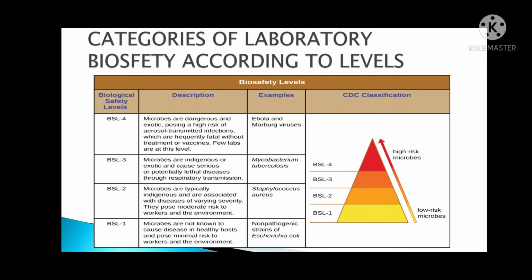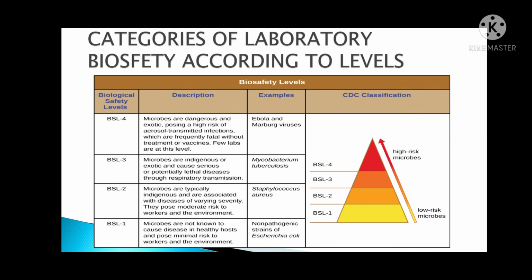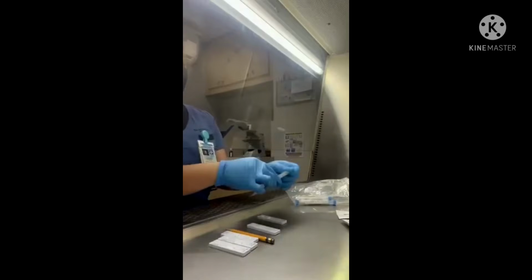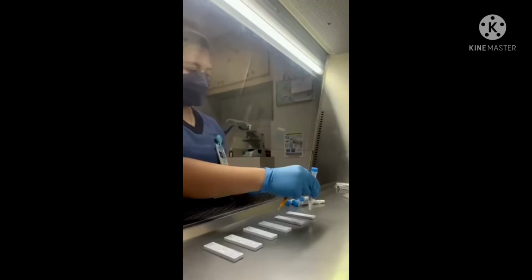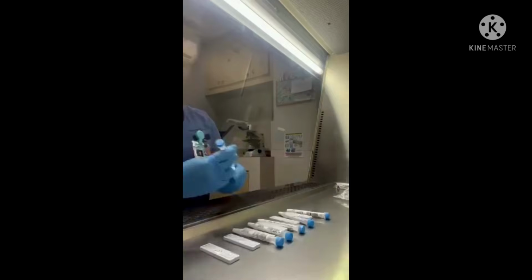The next type of biosafety level is Biosafety Level 2. This is basically designed for laboratories that deal with indigenous moderate risk agents present in the community. It observes practices, equipment, and facility design that are applicable to clinical, diagnostic, and teaching laboratories, consequently observing good microbiological techniques. Examples of microorganisms that could be handled under this level are hepatitis B virus, HIV, Salmonella, and Toxoplasma species.